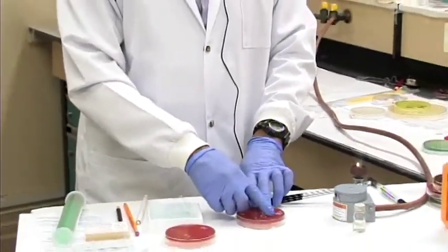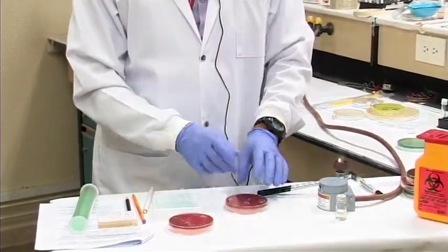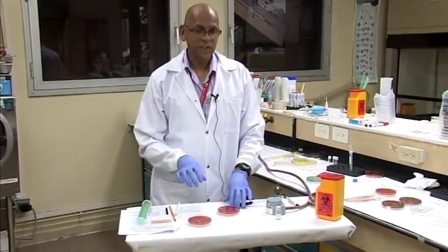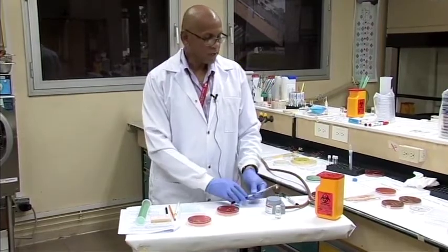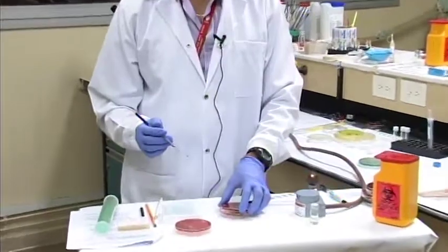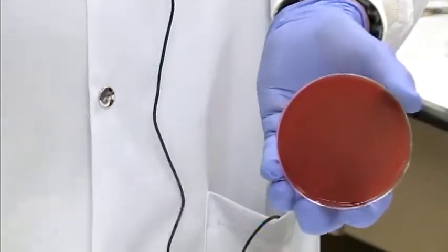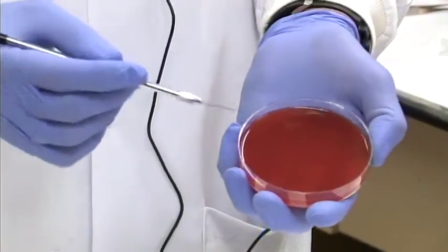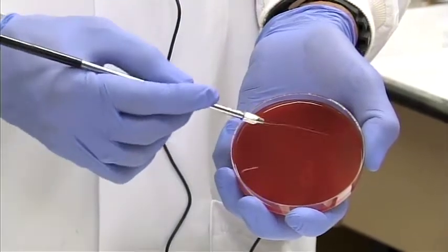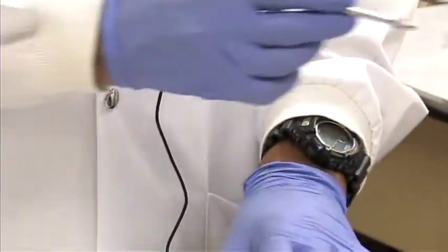That inoculum now we're going to use for what we call streaking. Now streaking is a technique used to dilute out your concentration of bacteria. So we have our inoculating loops again, which have been flamed and cooled before. And now we're going to show you how to streak the agar plate. So streaking, again, will create colonies the next day. So we're going to take our loop again, and we're going to start off with the pool and pull out about 4 or 5 times from the pool onto a fresh part of agar.